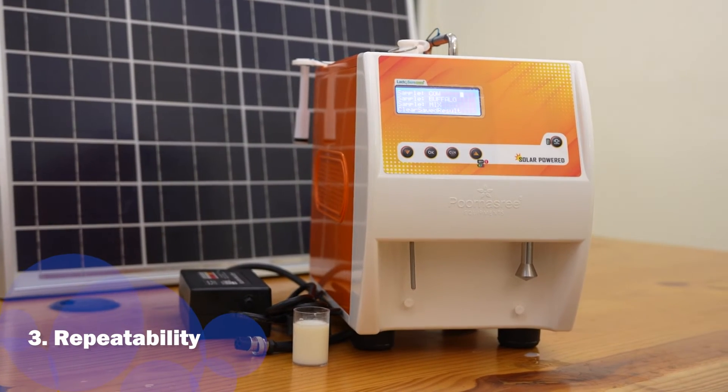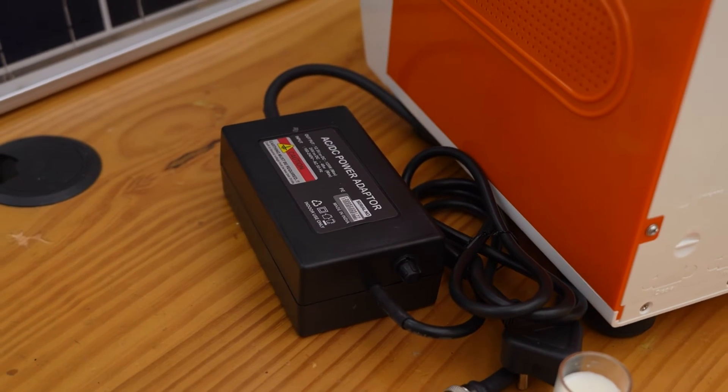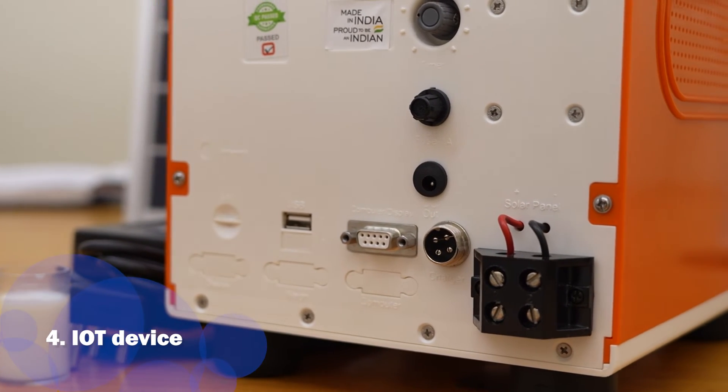Lactosure Eco SV has the highest repeatability among all the portable solar analyzers currently available in India. It is also an IoT device with USB support and Wi-Fi connectivity.